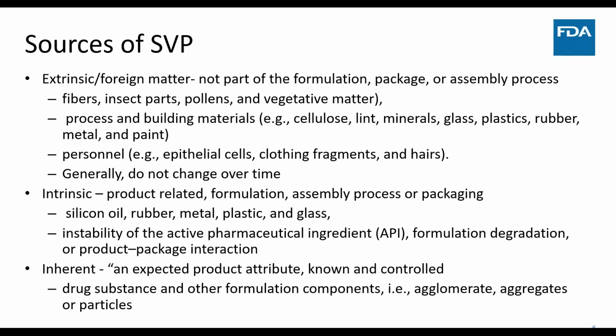Why do we care about the source of subvisible particles? I know most of us might have seen this in the USP chapters already. I threw this in there to highlight the fact that it is not just enough to be able to characterize particles, but knowing the source of the particle is very important in ensuring that we can establish the right control strategies to ensure that our products do meet the quality standards that we intend to.